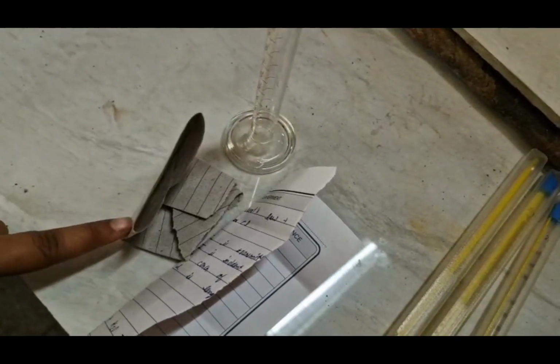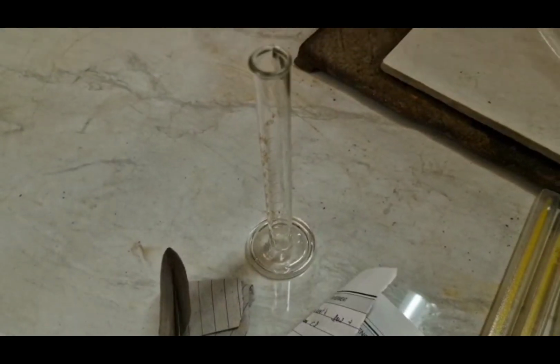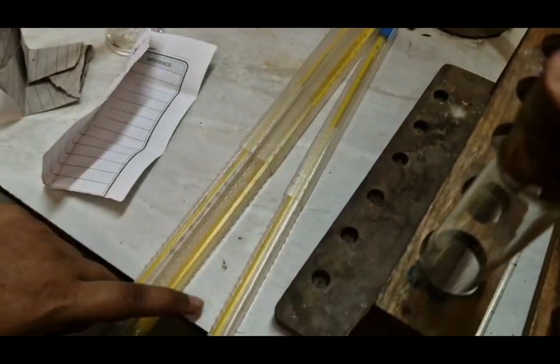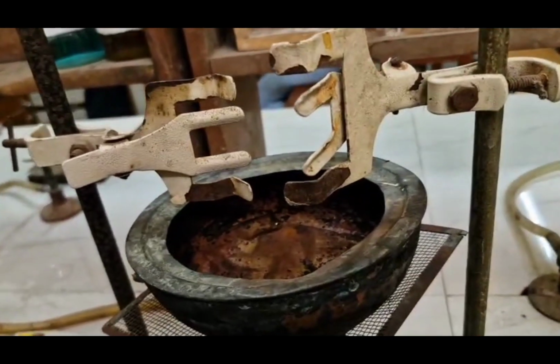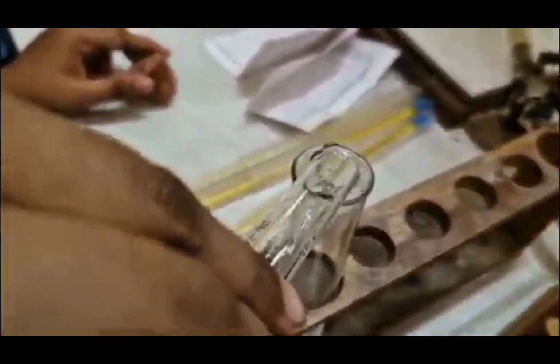Let's start. Our requirements: NaCl, phenol, measuring cylinder, thermometer. This is the test tube with cork and water bath setup. Firstly, we will add 2 gram phenol in a test tube and 2 ml water.